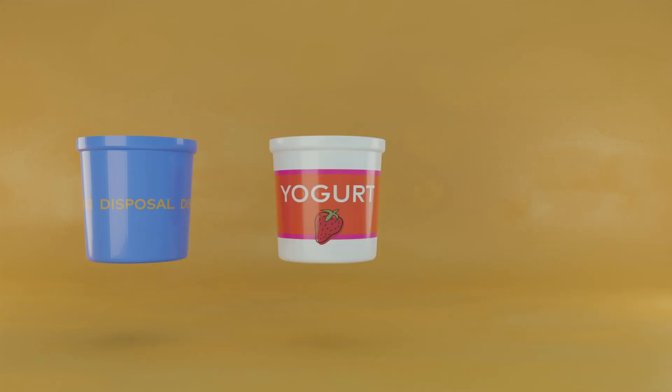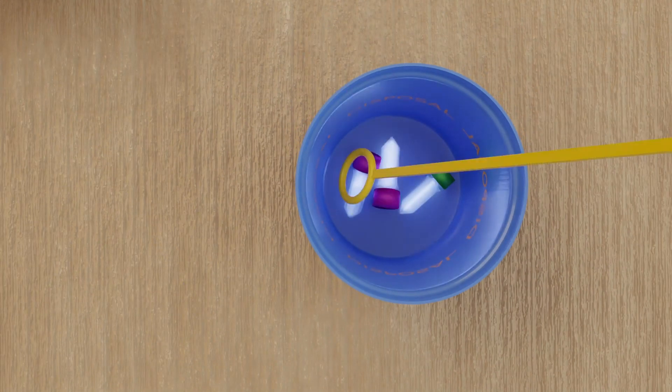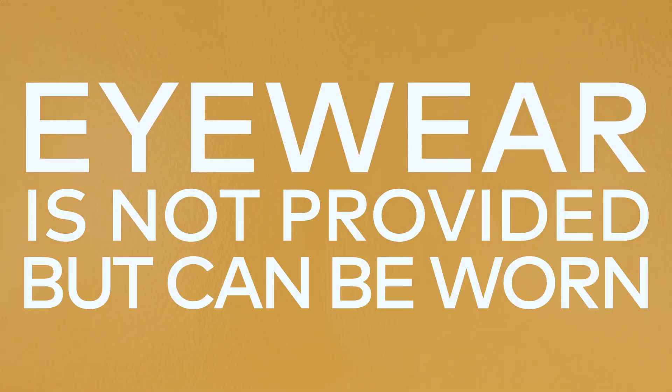An old one-liter yogurt container, large plastic cup, or the like will do. Used consumables will be loops, any tube, or used petri dishes. Eyewear is not provided but can be worn.